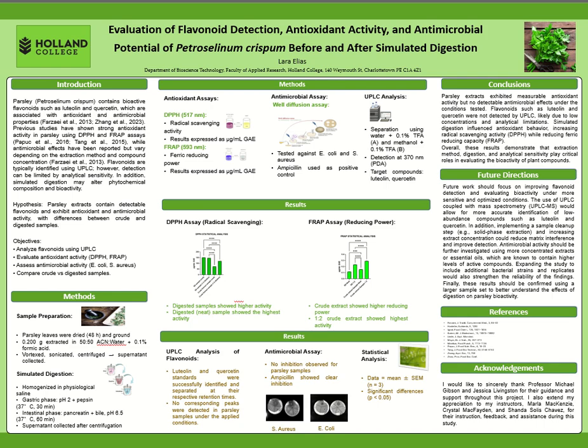The goal of this study was to analyze flavonoid content using UPLC, evaluate the antioxidant activity using DPPH and FRAP assays, and assess antimicrobial activity against E. coli and S. aureus while comparing crude and digested samples.